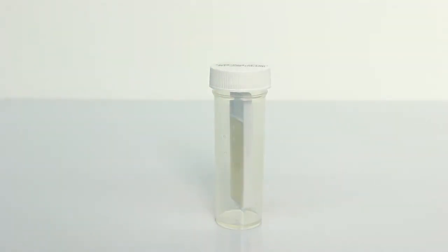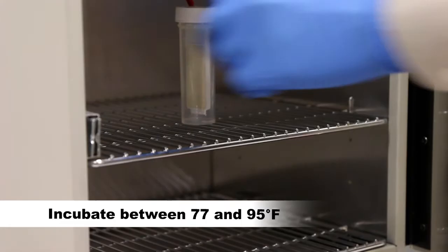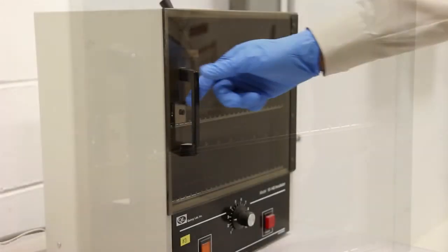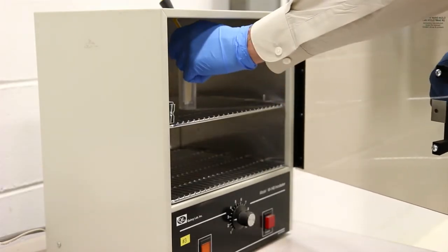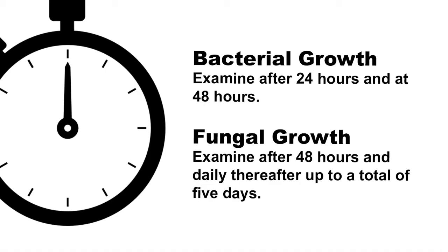Incubate the vial in an upright position at 77 to 95 degrees Fahrenheit. 90 degrees Fahrenheit is generally good. For bacterial growth, the slide should be examined in the plastic vial 24 hours after incubation begins and after a total of 48 hours. For fungal growth, the slide should be examined after 48 hours and daily thereafter up to a total of 5 days.